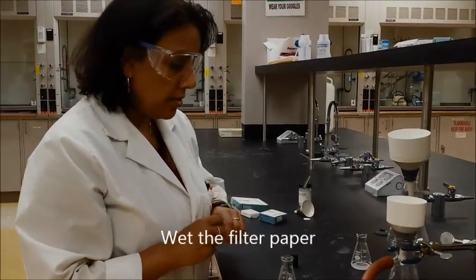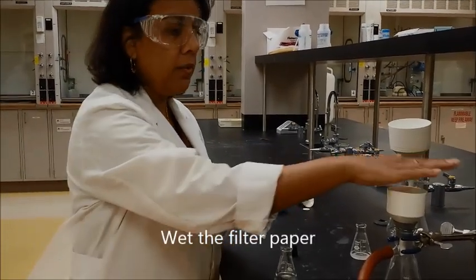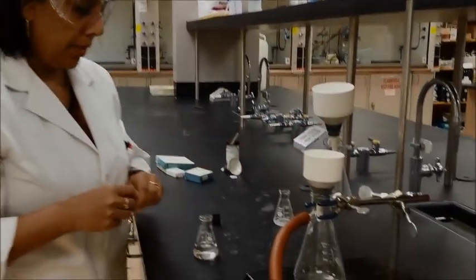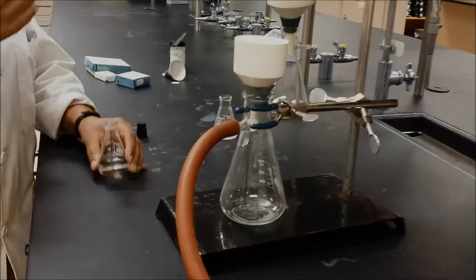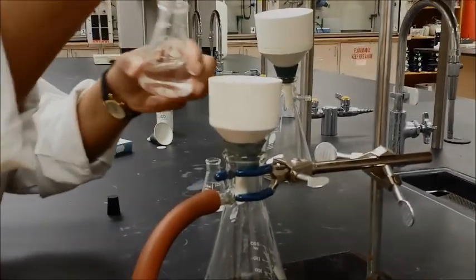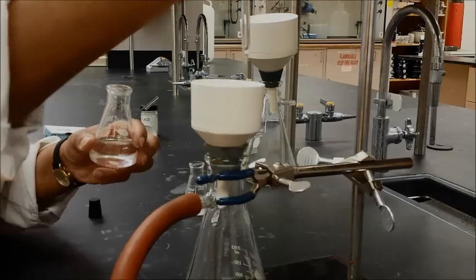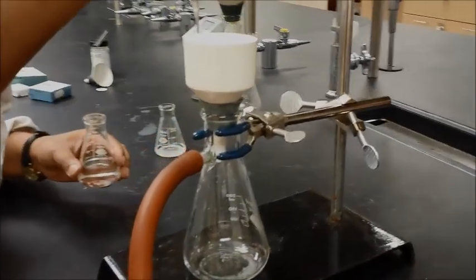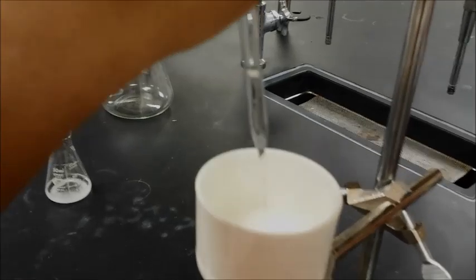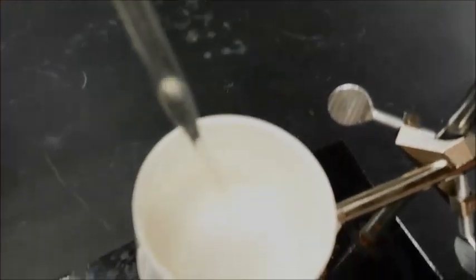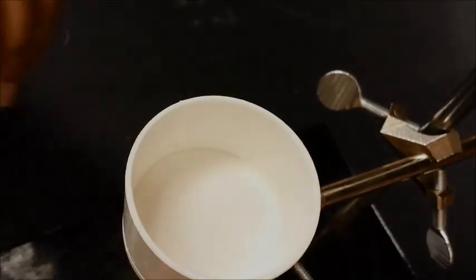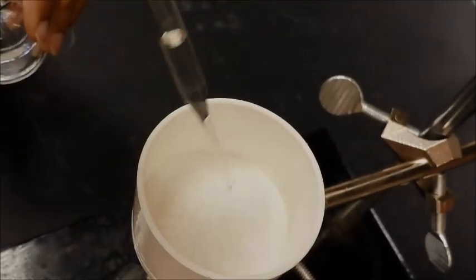I'm using hexane, so I will use hexane to go ahead and wet my filter paper. If I was using methanol, I would use methanol to set the filter paper. So, this is how you would do it and just pour a little bit of hexane on the Buchner funnel. So, make sure that the entire filter paper gets wet.